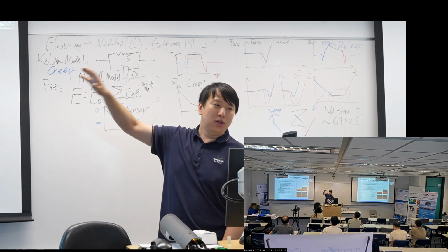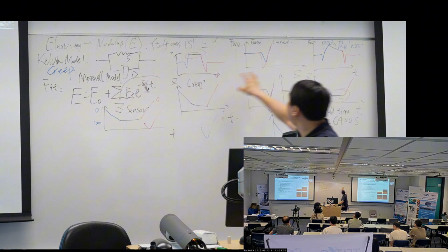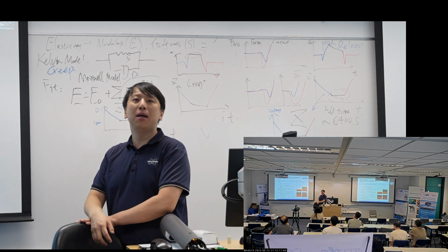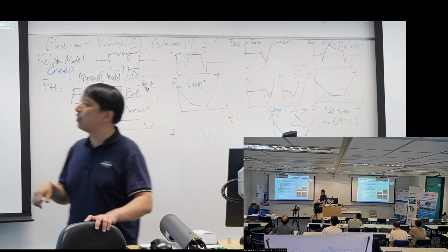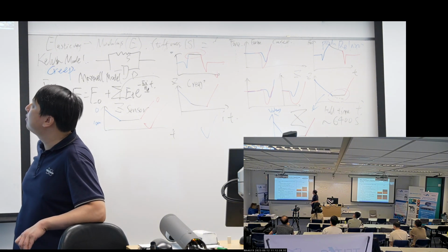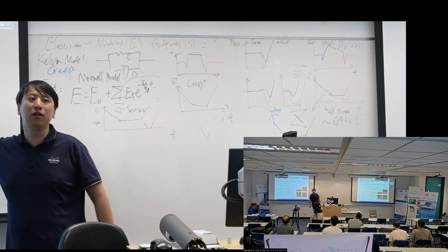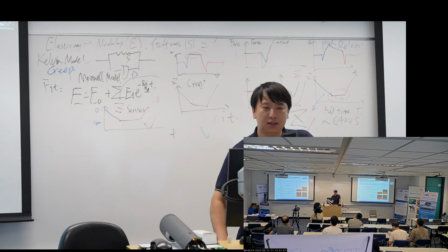And nowadays, with ramp and hold, we can do creep or relaxation on each data point, so we can capture more complex mapping with this force volume function. In the afternoon hands-on session we will do pure force curves, and then we can apply hold on the force volume.